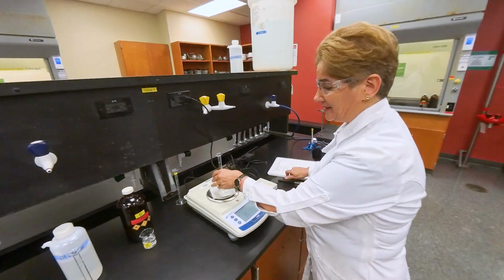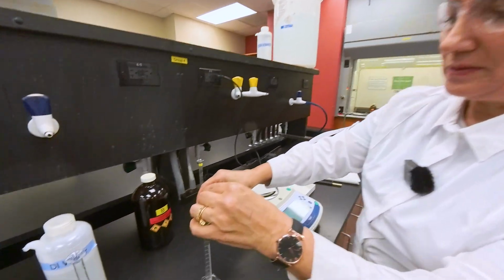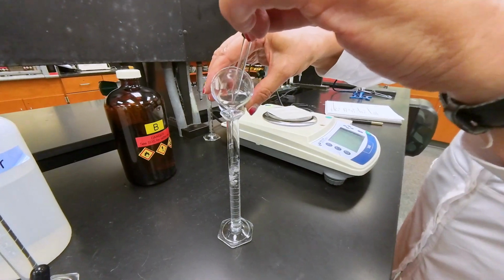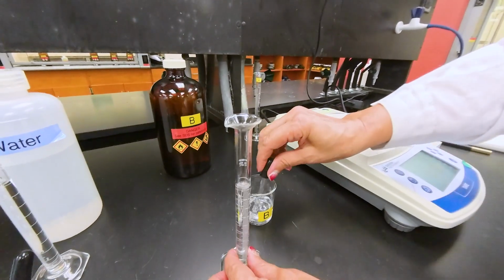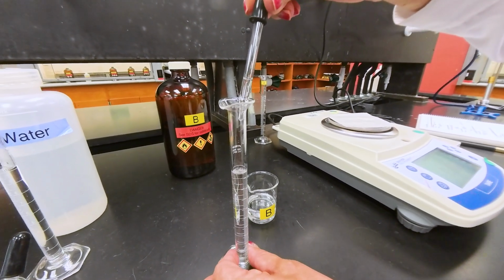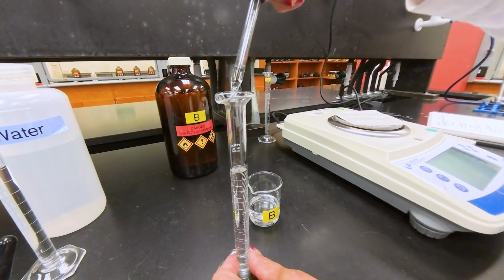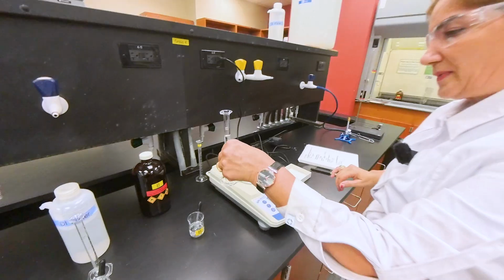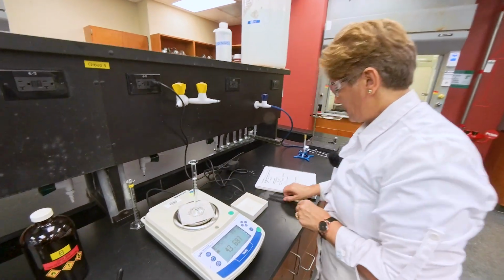Then we add exactly 10 milliliters of the liquid. Again, I'm going to transfer by pouring, make it close to 10, and adjust the level to get the meniscus to be exactly at 10. Okay, the meniscus is now at 10. You record this volume and measure the mass again.